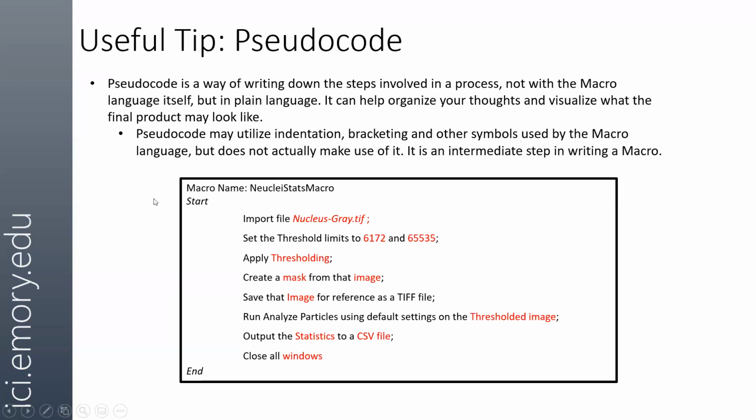So really what it is, it's a set of instructions you want to repeat, maybe just once, maybe several times in a row, if you're looking at a set of outputs, a set of stacks, or what have you. But this is a good way to visualize it, because even now, we've already taken care of some of the issues that could crop up as we're writing a macro.